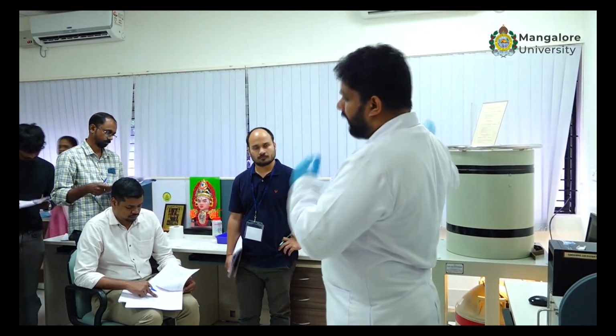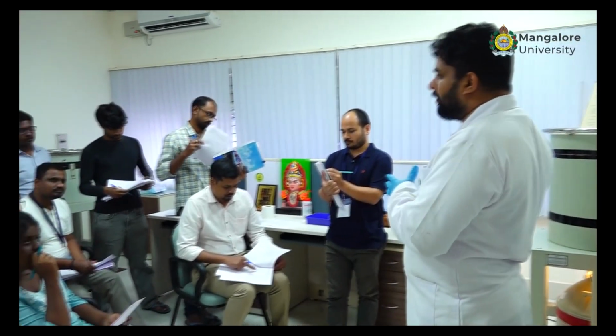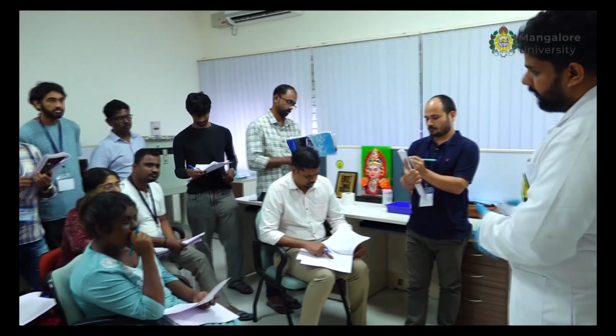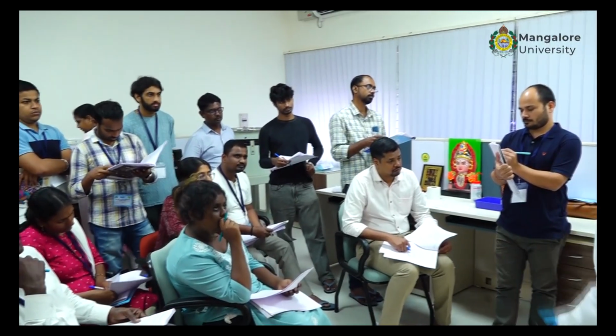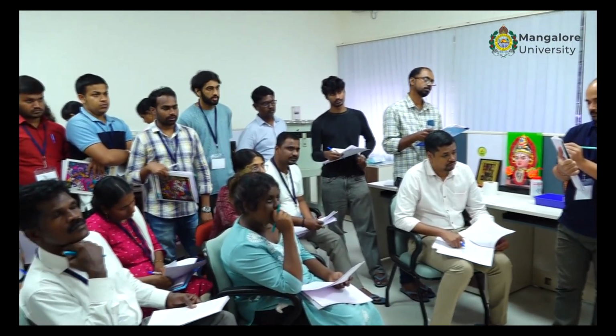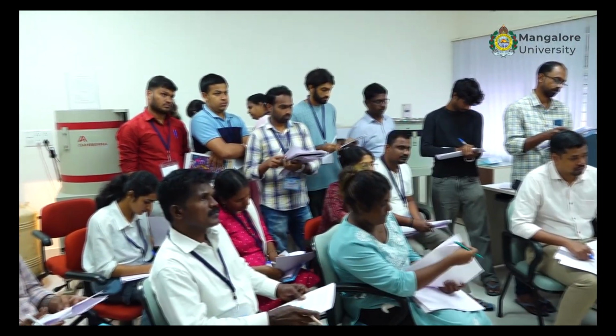First identify the radionuclides present in the spectrum, then count them, whatever counts you are getting, then calculate the efficiency. This much work you have to do today. So you can start.